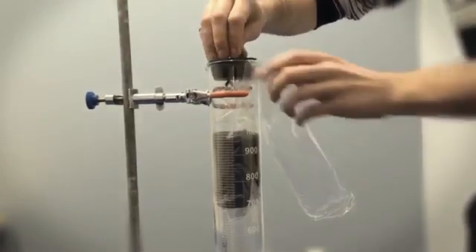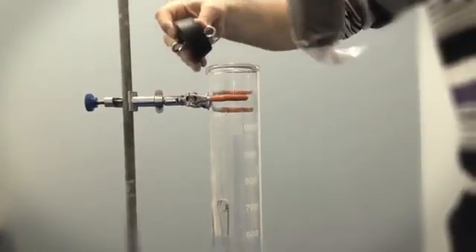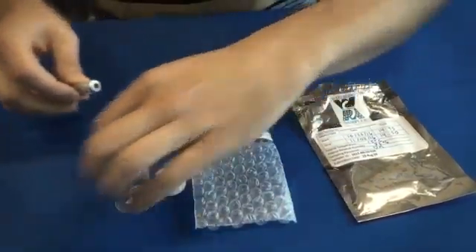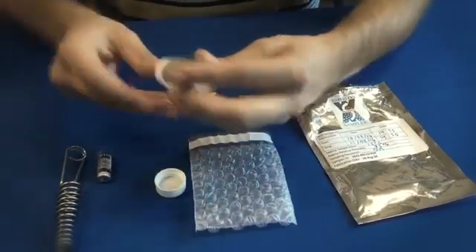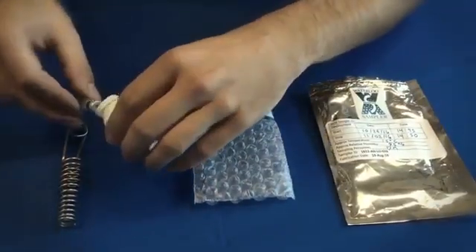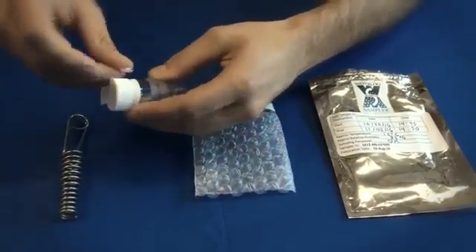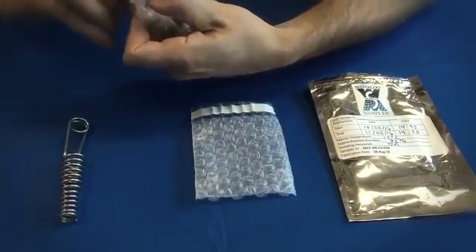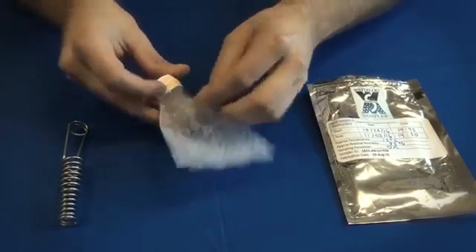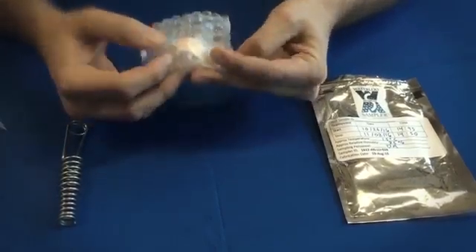At the end of the sampling period, remove the rubber stopper and pull up the plastic bag to remove the seal. Retrieve the sampler by pulling up on the fishing line. Remove the sampler from the wire hanger. Remove the mini pack from the glass vial and place the mini pack in the aluminum pouch. Return the sampler to the glass vial. Seal the cap with Teflon tape and zip lock the vial inside the aluminum pouch.